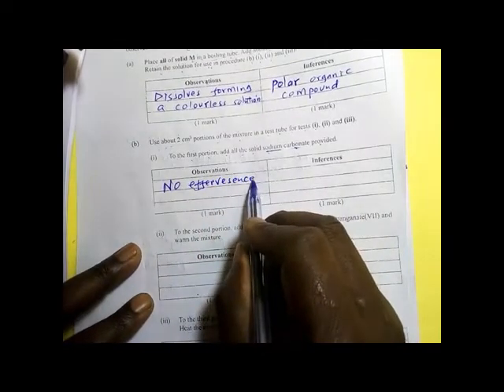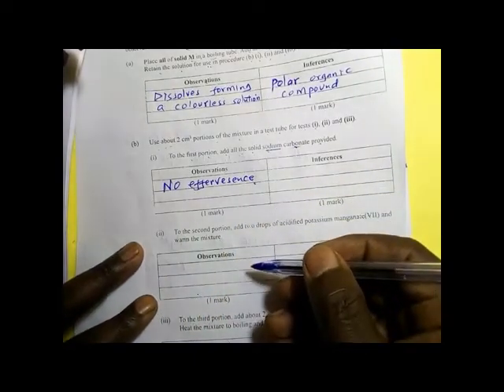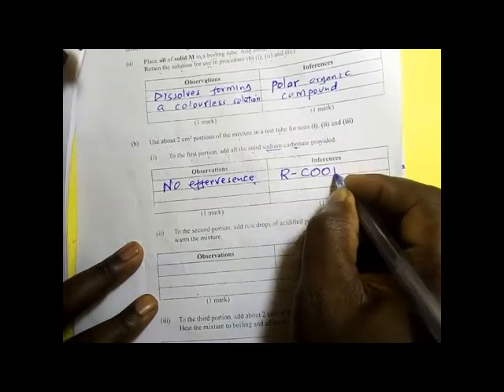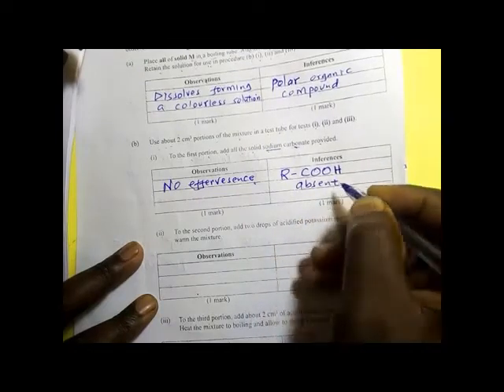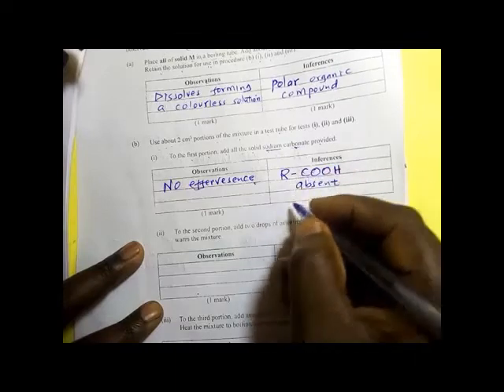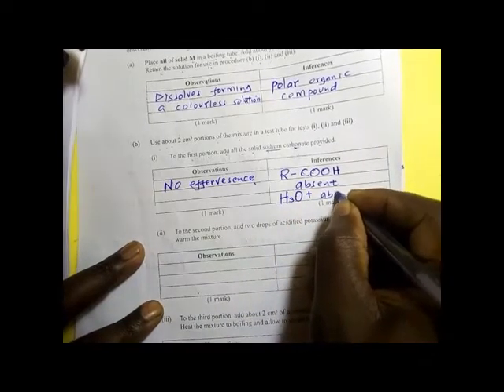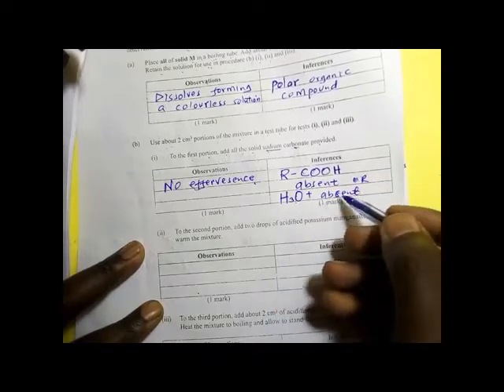If there is no effervescence, it means that the organic compound was not an acid, not an alkanoic acid. So therefore we say RCOOH, the functional group of alkanoic acids, was absent. If this one disappears from your mind or you forget, you can write the hydroxonium ion, it is acceptable. Absent.